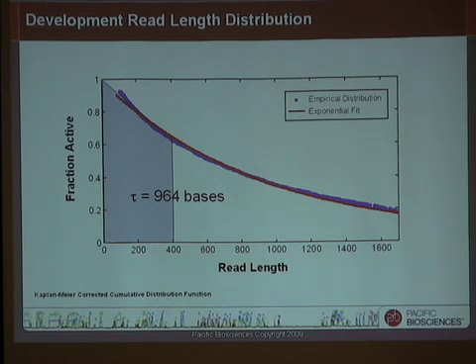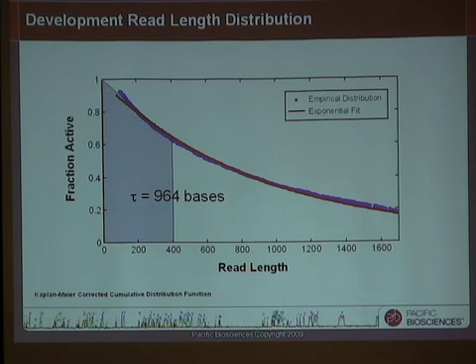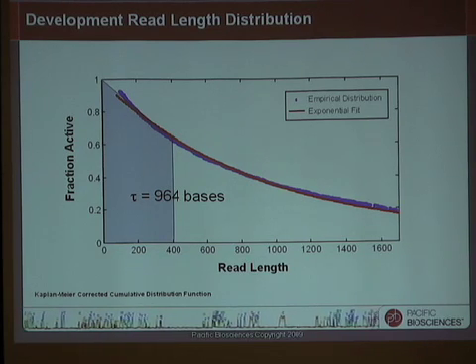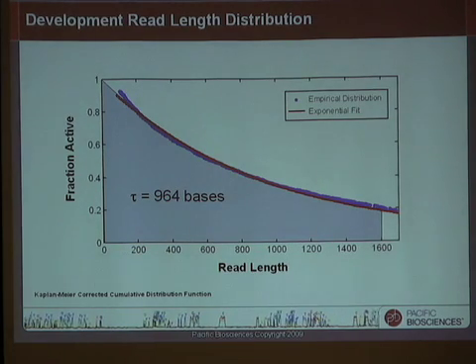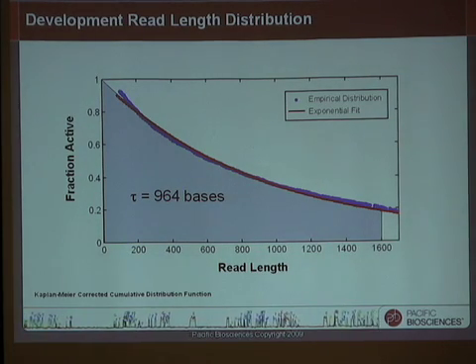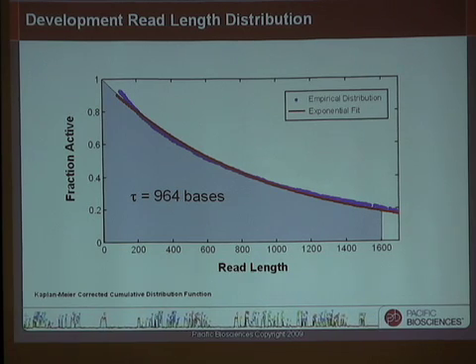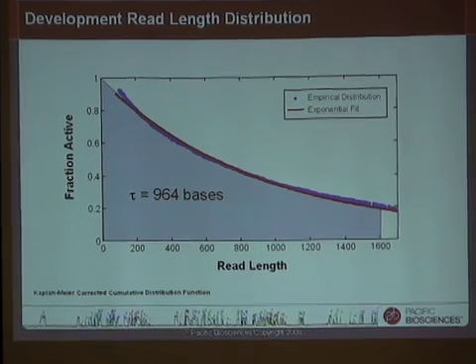This exponential read length distribution gives us a flexibility built into the system so that I can run short reads and have high throughput. So for example, a short read, at the end of which I still have the majority of those polymerases still producing sequence. Or I can do a long run, maybe even a multiple of the average read length, and by doing so I'm trading off throughput, because now only a fraction of the original polymerases are still contributing data. But nonetheless, even out to a multiple of the average read length, you can still get a usable quantity of reads. And that's how we extracted this 3.2 kilobase read with an average read length of just 1,000 bases.